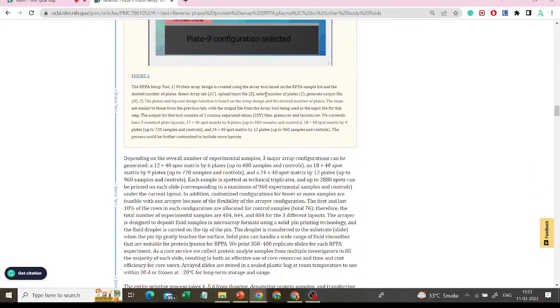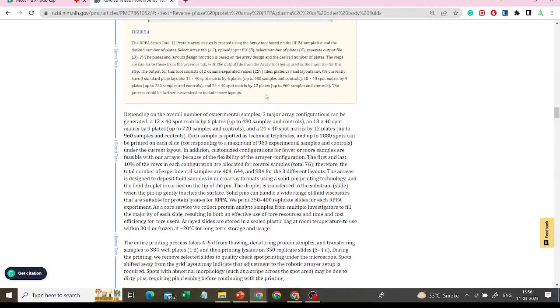So here, the two most important points I wanted to make are that you need to first check that your antibody is giving a single band and not two or three bands for each particular protein, and only then can you take it forward, because otherwise it would become difficult to understand whether your signal is true or false. Secondly, the sample preparation and the printing of the slide.